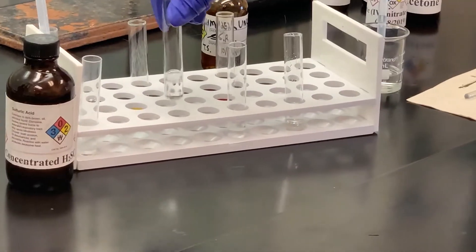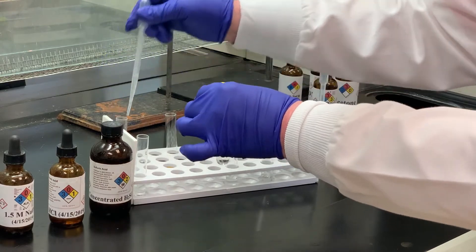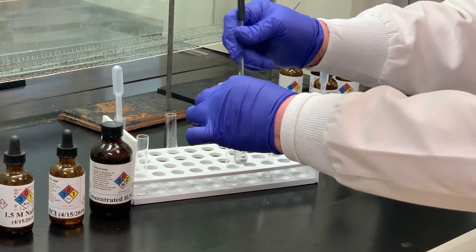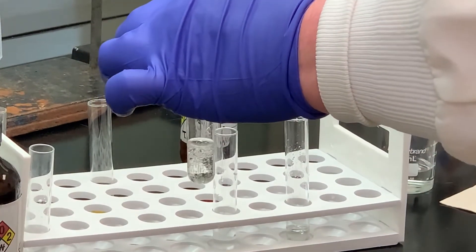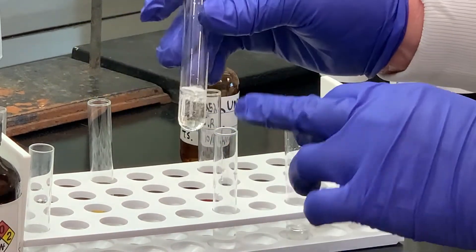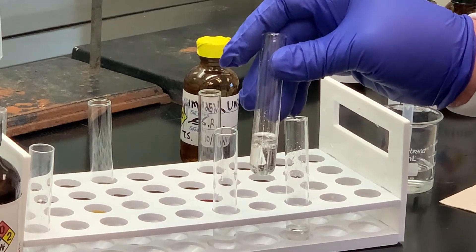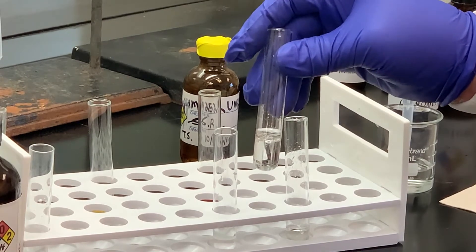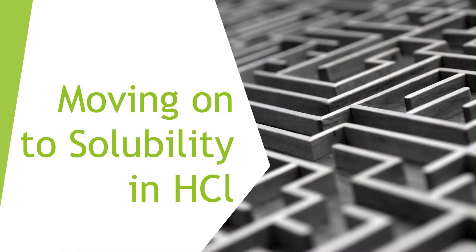I've got some 1.5 molar sodium hydroxide. I'm going to take some of my sample and add it to that. When I stir that you can see the droplets, and then they form two layers. If you add a couple drops of your unknown it may be very difficult to tell if it is the meniscus or a layer. It doesn't hurt to add more drops to see if that layer gets bigger — then it's not the meniscus, it's the insoluble layer. So we know it's not soluble in sodium hydroxide.